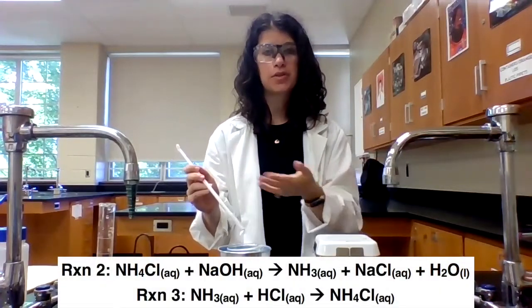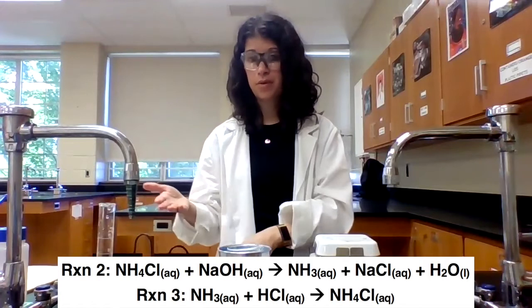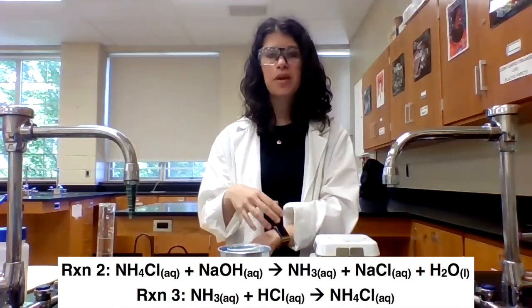And then I'm going to clean out this beaker and do the exact same thing, but for reactions 2 and 3. Now, reaction 2 produces ammonia gas, and in reaction 3 you start with an ammonia solution. So reactions 2 and 3 actually need to be done inside a fume hood. So for those, I'm going to collect my data by doing the same process, but I'm going to do the reactions inside a fume hood rather than on the benchtop here because of the ammonia. But everything else is going to be the same. I'm going to record the initial temperatures of the two reagents, mix them, and then record the temperature of the reaction every 20 seconds for 3 minutes.